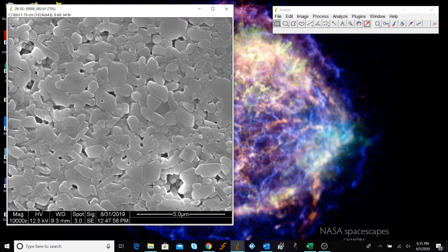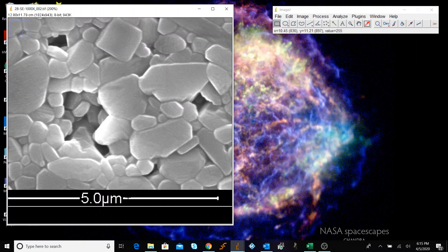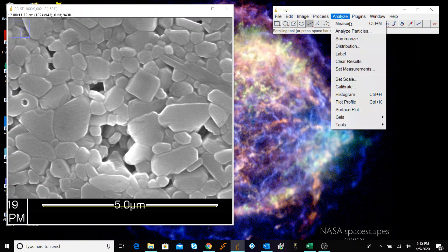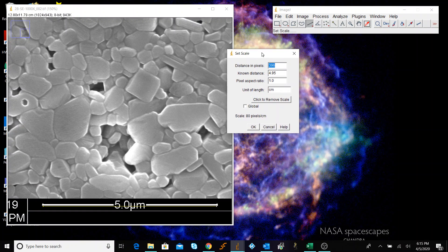A few things we're going to be doing today: first, setting our scale, and then doing the line intercept method. If you forget how to set the scale, watch my previous video on this channel. We use the line tool from one end to the other, then Analyze > Set Scale. We'll make this an even 400 — this is five microns — and we're going to make this global, because we'll be exiting out and bringing back this particular image.